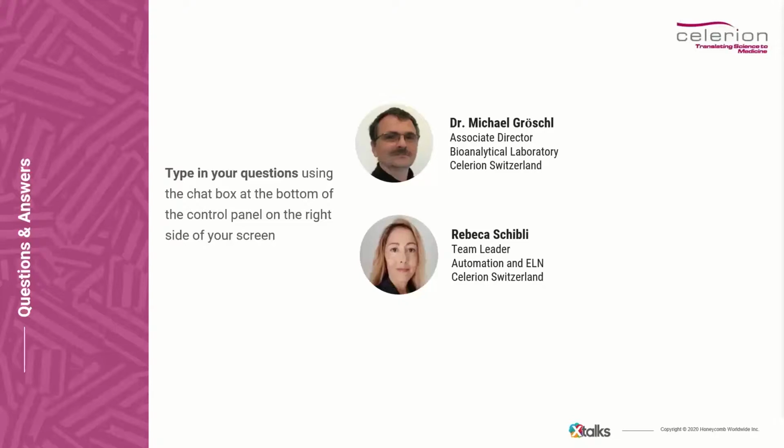It's easy to handle. We here have projects that appear once, that last, let's say, 2 weeks. Then the samples are measured, the report is finalized, and then we don't see that method anymore, unfortunately, and have already to develop the next one. So the continuous changes, the requests for many different methods in short time, that is what makes it so different for a CRO.